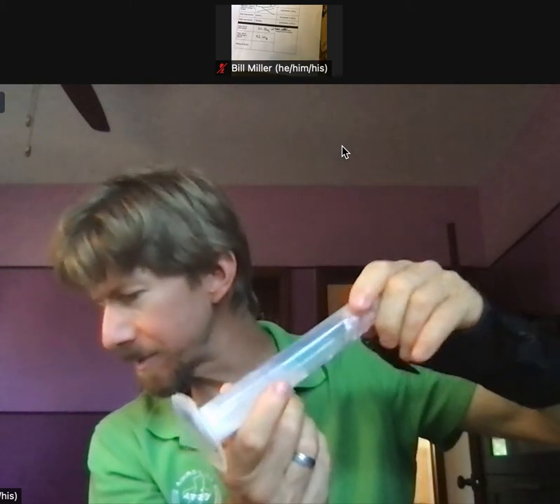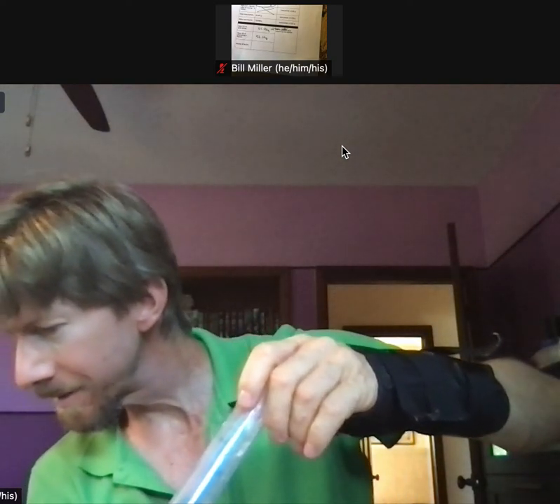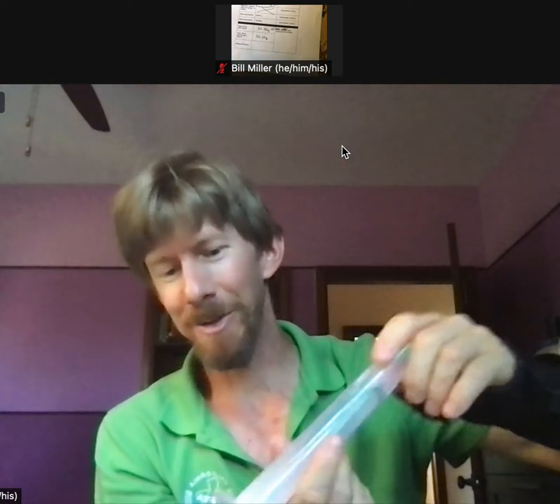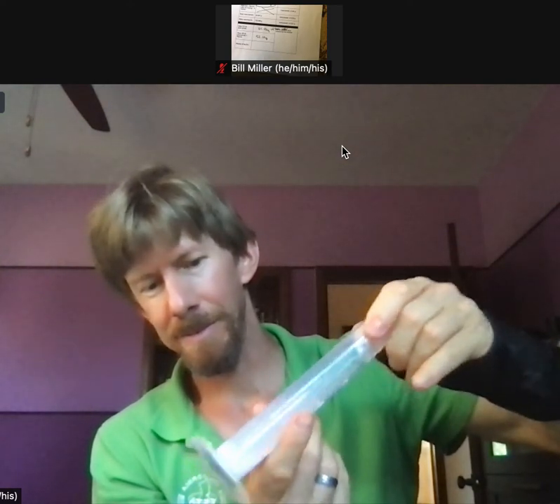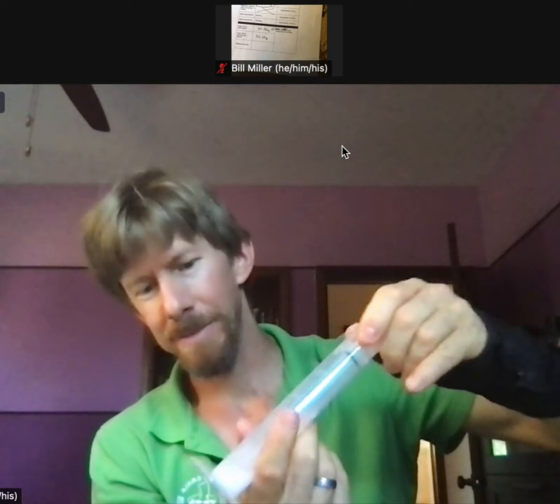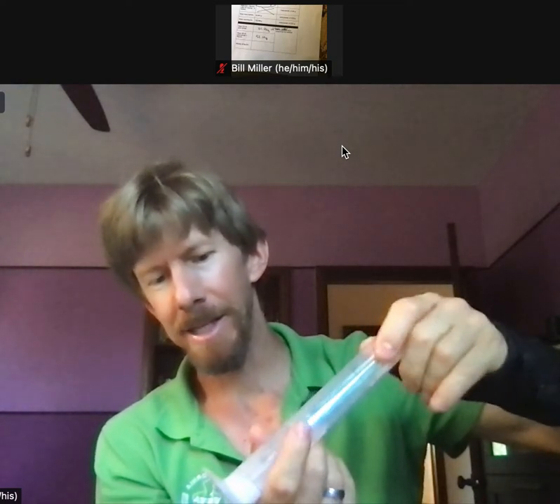Oh, we're going to fill it up to 50, and then fill it up. Oh! I'm going to have to transfer this to a 100 milliliter graduated cylinder. No wonder it's so hot. Because what we want is 100 milliliters for the next experiment, for the titration experiment, not 50 milliliters.